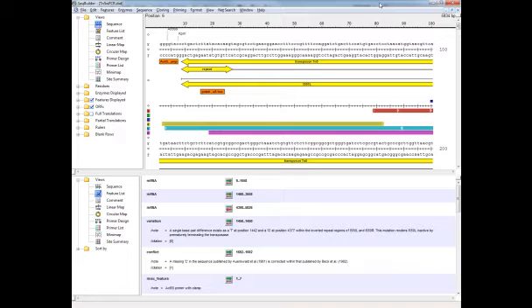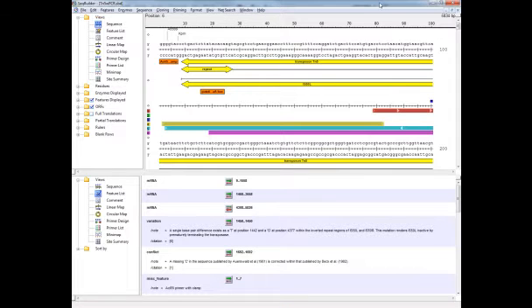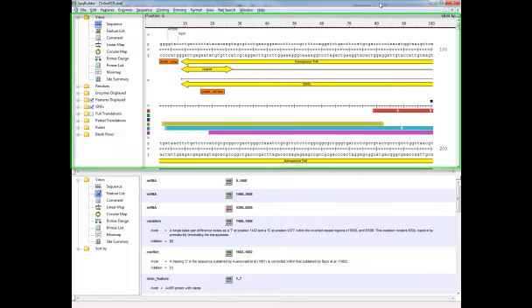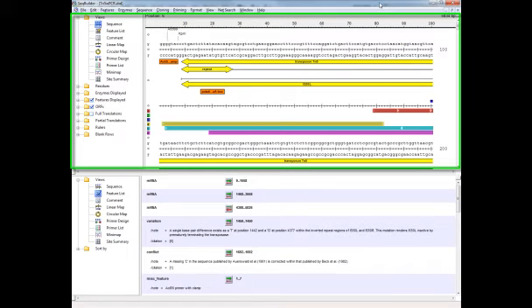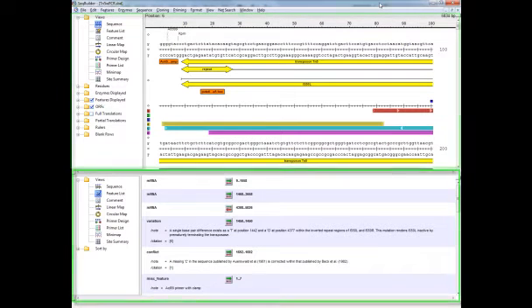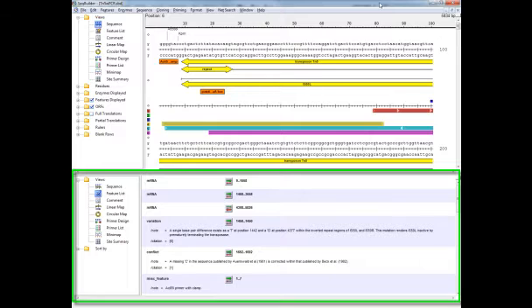Before we get started on the views, let's cover a few of the basic things you need to know about SeqBuilder. The SeqBuilder application window is divided into panes, so you can see on my screen right now I have two panes. The top one here is showing the sequence view, and the bottom pane is showing the feature list view.